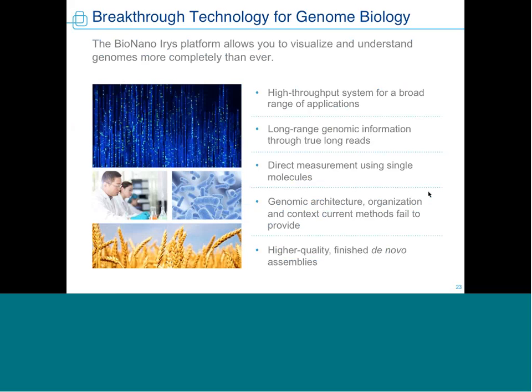I'm going to hand it over to Mike now for him to talk about how he's been using this technology. But I'll just sum up with a few things that I showed. Really, the ability to get this individual molecule data at an extremely long range allows you to visualize and understand genomes more completely than you can with fragmented and relatively indirect methods, to get the additional genomic architecture and organization information that you can't get any other way to do structural variation and de novo assemblies.